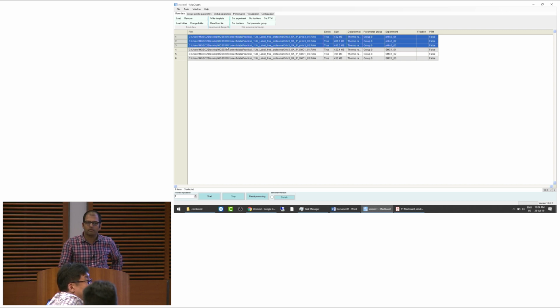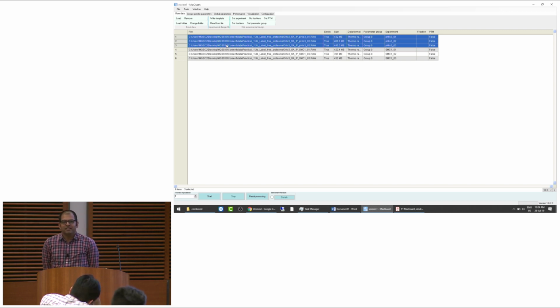So if you were to do a pre-fractionation with reverse phase high pH and you combined every eighth tube, what would you do there? That sounds like a feature request. Yeah. They have to make linear fractions or circular fractions.